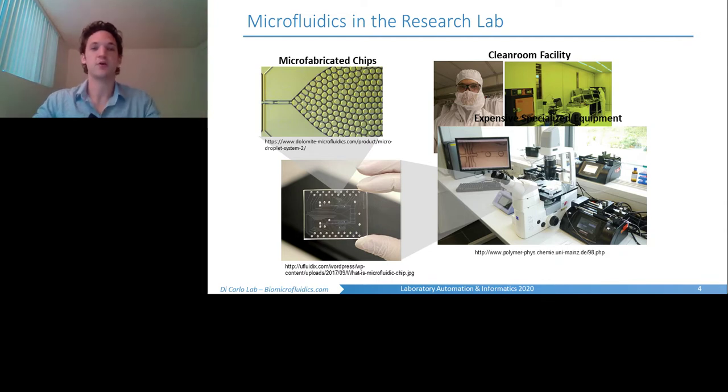But realistically, we know that this is a simple device embedded in a much larger chip. And if you wanted to fabricate one of these chips yourself with your own design, you need access to a high-tech cleanroom facility. Assuming that you have these things and you're able to manufacture a design that you want to use for your project, then to actually use these, in most cases, you need access to specialized and often expensive equipment to run these devices. So these are several barriers to entry to actually using this technology.